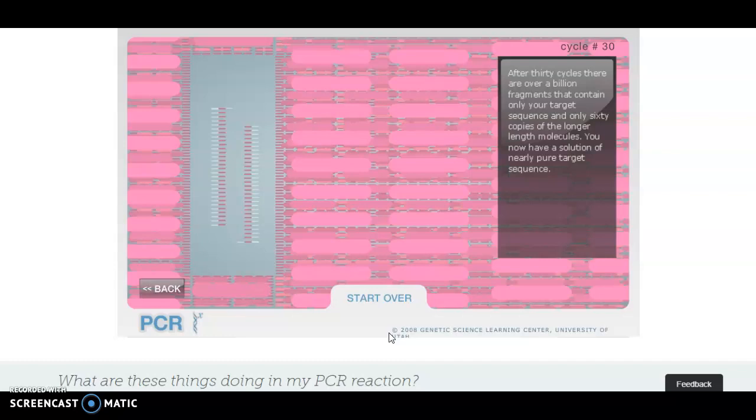When we're going to be talking about genes in space in just a little bit, this is what it's going to be dealing with. We're going to be coming up with science experiments that could be done in space utilizing PCR. So basically studying DNA up in space and using this machine to do so. So really cool stuff, really cutting edge. I know I get a little bit crazy on these things.